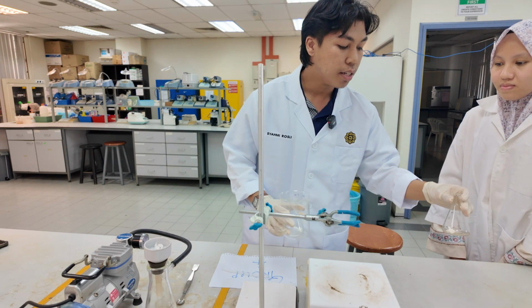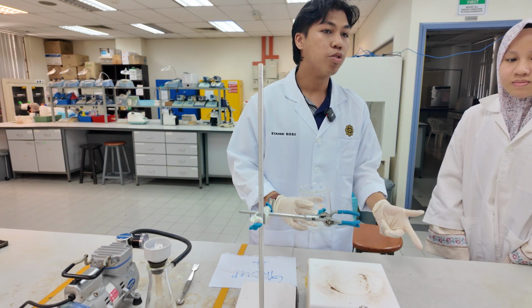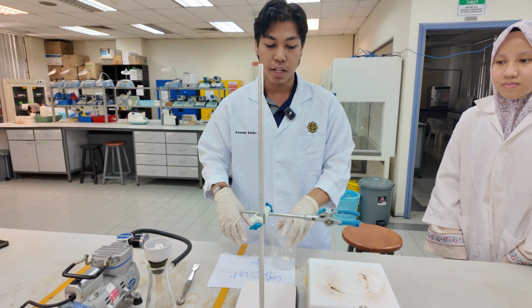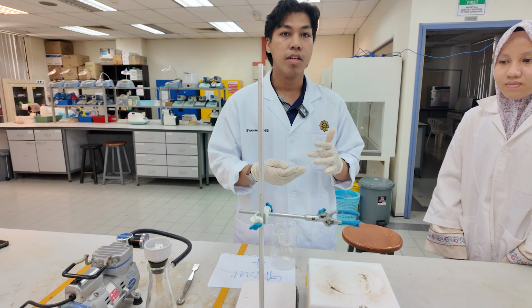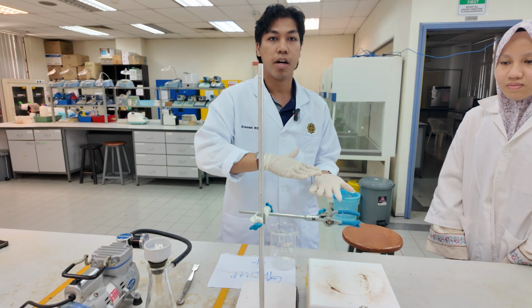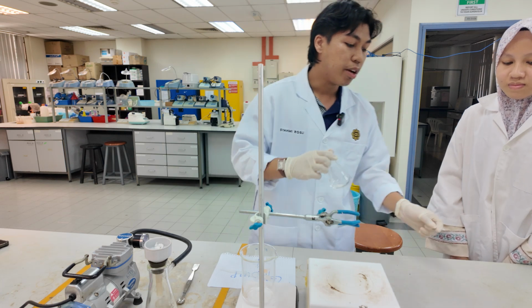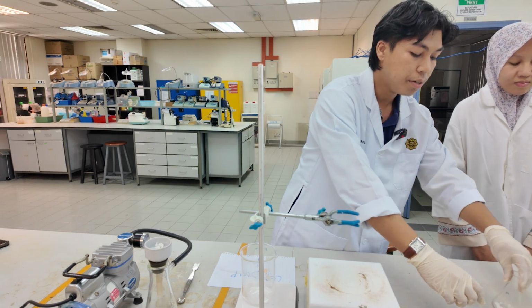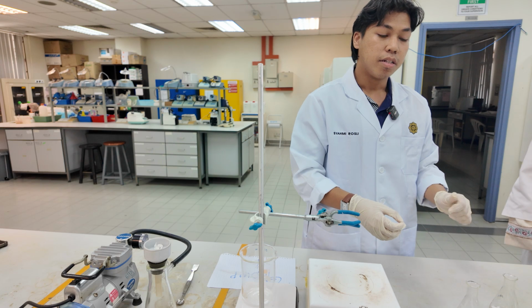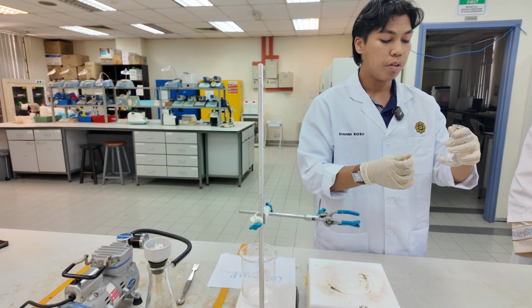For the single flask here, just put it aside and let it cool to room temperature. After some time we can see the crystal starting to form inside or below the conical flask. Then after we take this out and compare them both here, we can see the crystal has started to form below the conical flask.